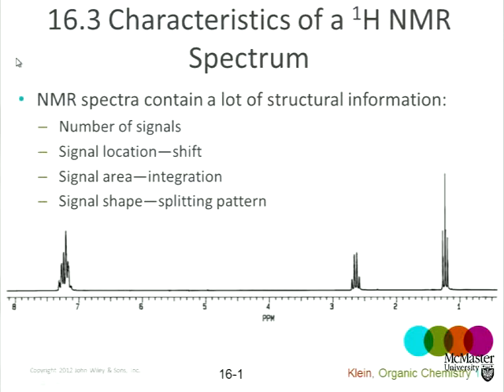Here, there are 2 identical protons at 2.6 ppm. CH2 group, right? We've got a methylene group. And something is making it move away, move down from where we would expect a CH2 in an alkane. So this methyl group looks something like a methyl group in an alkane. It's probably bonded to a carbon. This CH2 group, however, has something next to it. It's got a functional group next to it. We can tell that from the chemical shift.